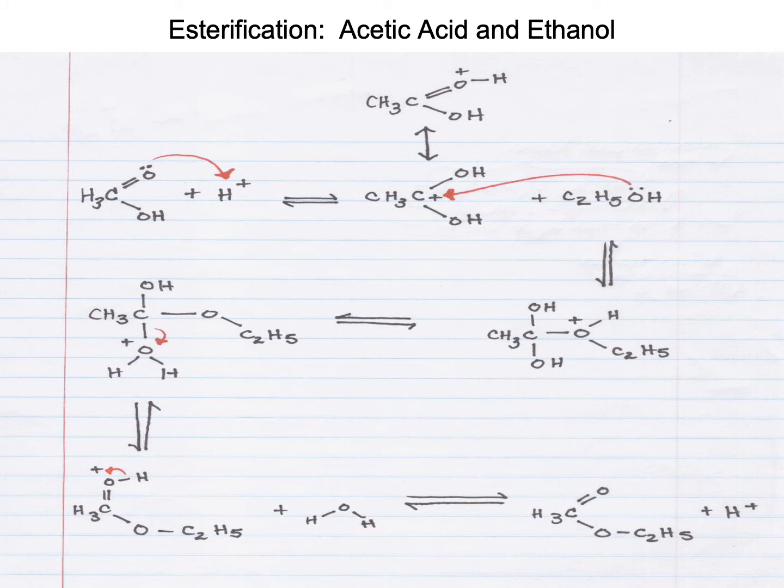You see all the reaction is in equilibrium. That's why we decided to increase the acetic acid in order to facilitate production of the ester.